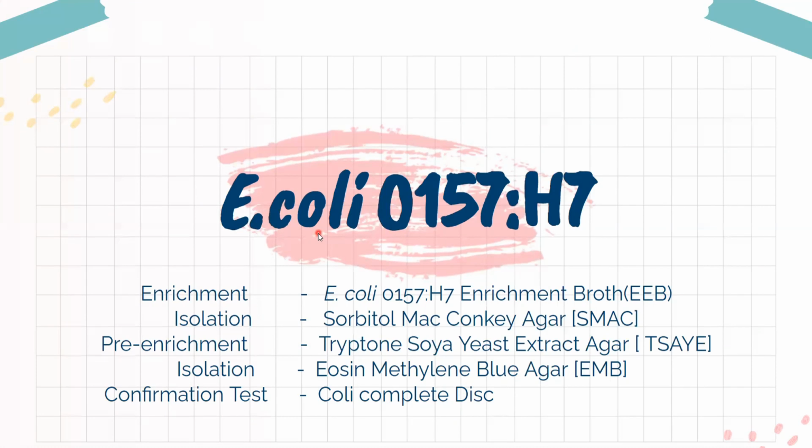Firstly, in the food sample, these organisms are present in quite a low number. So the first step we need to do is enrich it. Enrichment is done using the EEB broth followed by isolation on the SMAC. This is the first method.